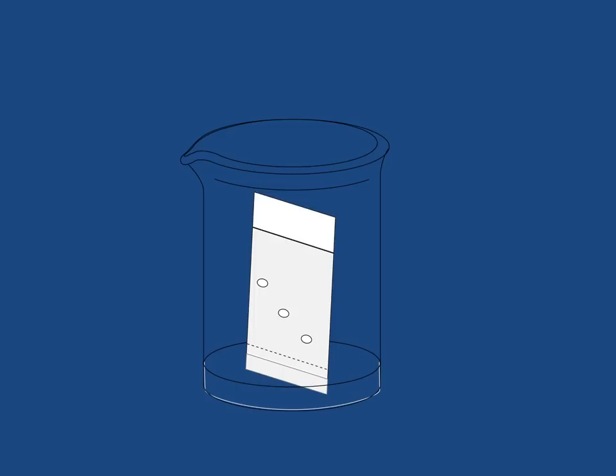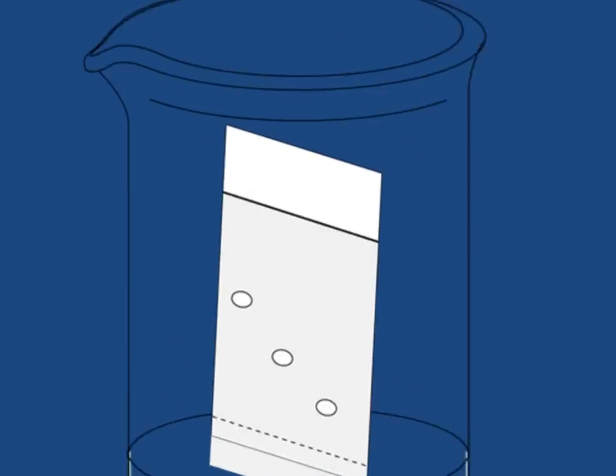Now, instead of zooming all the way down to the molecular level, let's take a look at our TLC plate as though the entire screen were a single plate. In doing this, we can visualize how a TLC experiment will work as we go through the setup, the development, and the analysis of the plate.